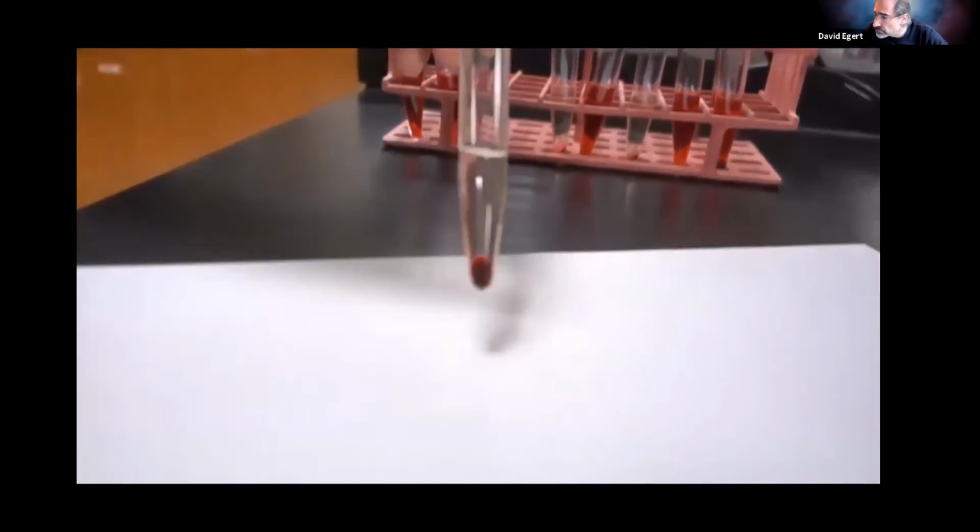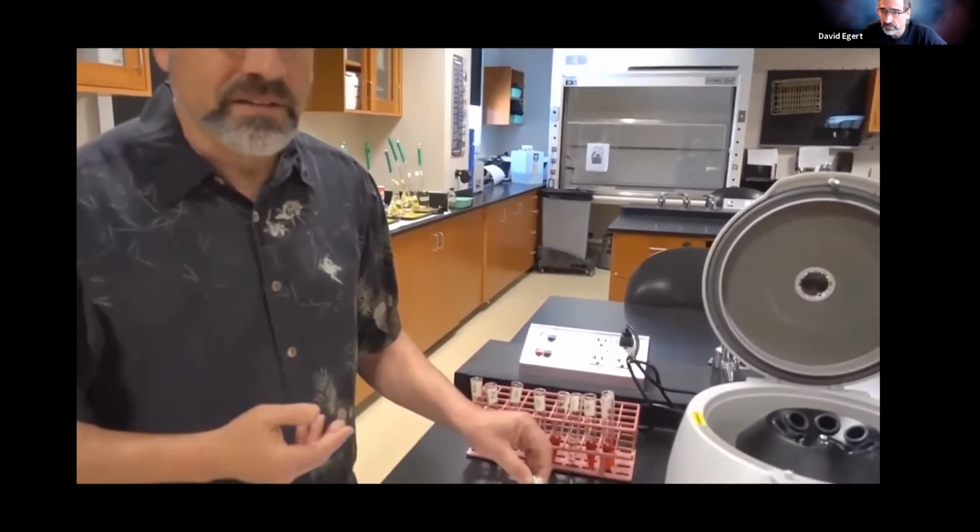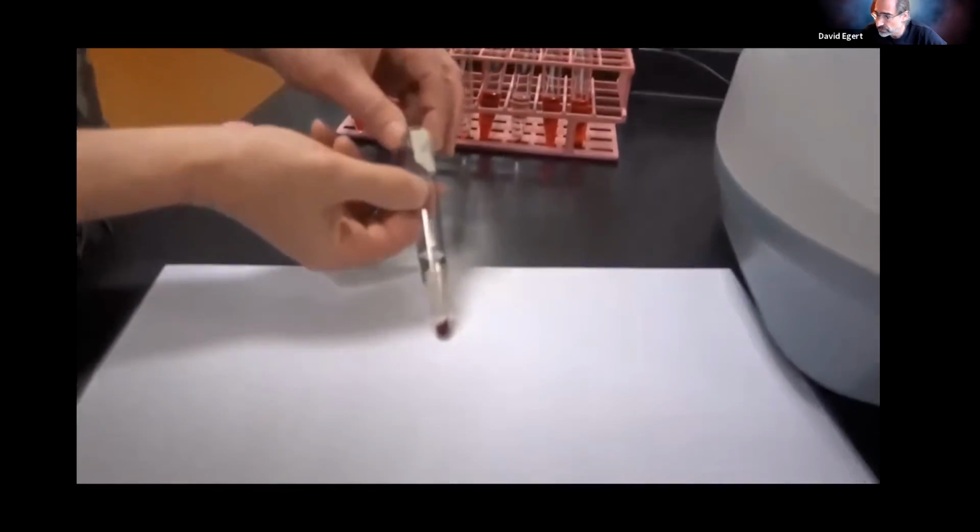And we can see the one that is in the 0.3 osmolar solution. This is what we would hopefully expect the cells to be in, an isoosmotic, isotonic solution. And we see in general, the cells all just got pulled to the bottom intact. There is a slight blush here, which you wouldn't really expect, except I think in this case, the cells have been sitting around for a while. Some cells might have just died off because they're getting old, not necessarily because the solution did it to them.